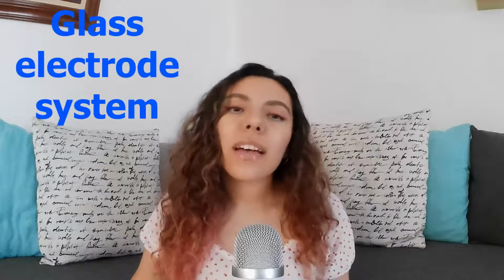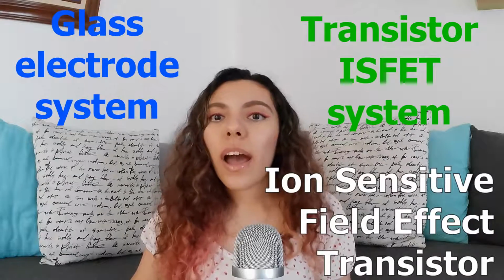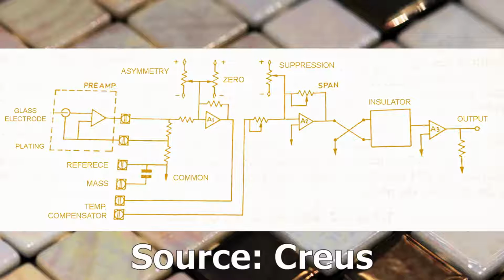Various methods can be used to measure pH, among which the most accurate and versatile for industrial applications are the glass electrode system and the transistor ISFET system. ISFET stands for Ion Sensitive Field Effect Transistor. The glass electrode consists of a glass tube closed at the bottom with a glass membrane especially sensitive to hydrogen ions. In the internal part of this membrane, there is a buffer chloride solution of constant pH, within which a silver thread coated with silver chloride is immersed.